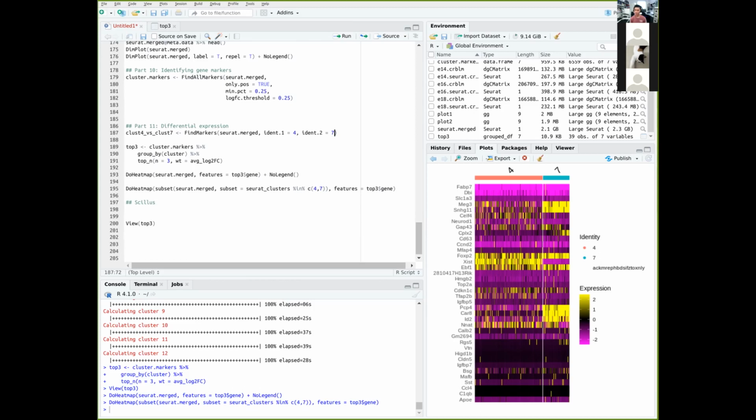You also have other non-R tools like Scanpy, which runs the same analysis on Python. Does use similar model, but maybe you get slightly different clustering and different marker genes if you use different tools. But essentially, you get the same idea and the same enrichment.